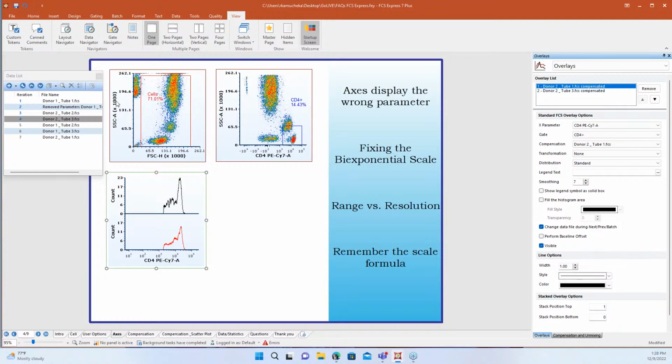FCS Express is going to try to load those 2 files every time it moves to an iteration, and at some point everything's going to go gray because it's not going to know what to do. But there is a nice easy fix, because a lot of times you want that overlay, you want those data files to be showing, but maybe you don't want them to move through the batch the same way that you would your other iterations. So just like she's showing there, you can go to the overlays of that plot, and there's that button there that says change data file during next previous batch. And so if you uncheck that, you'll see that all of your iterations turn blue again, because now the software can move those files through all the rest of your analysis, and it will hold those overlays there where they are. So that is perfect.